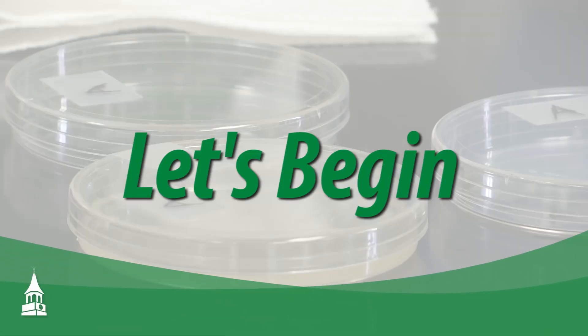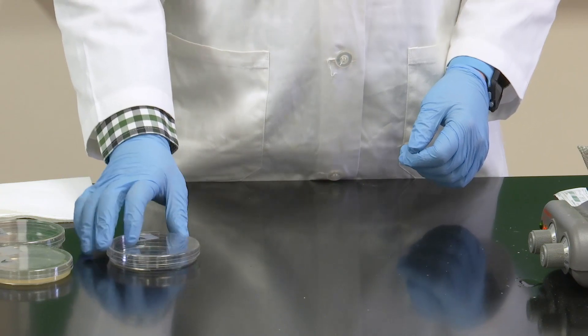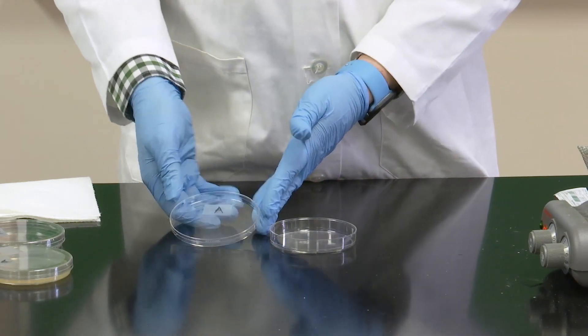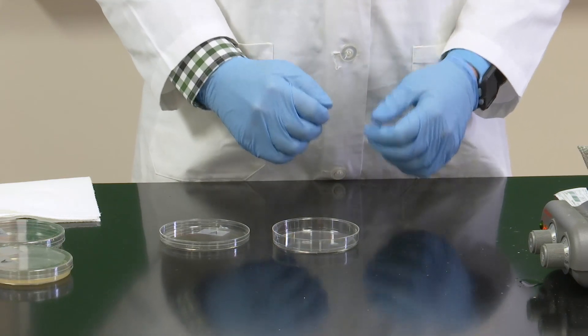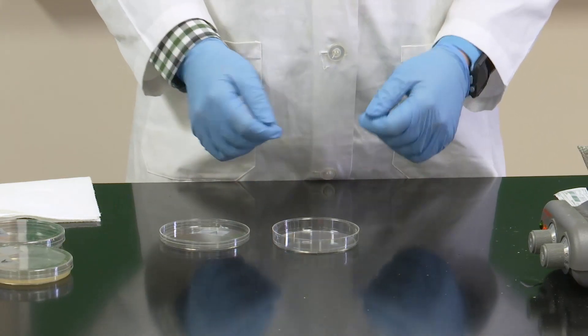Now, let's begin. You will need to open up and lay out the petri dishes. Be careful not to touch the insides. Even with gloves on, you may have picked up some hitchhiking bacteria that can contaminate your sample.